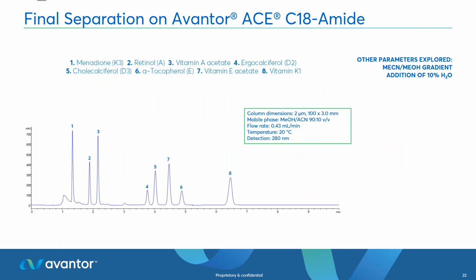And here we move forward, we took that initial method and optimized it further on the C18 amide, because that showed a good selectivity.